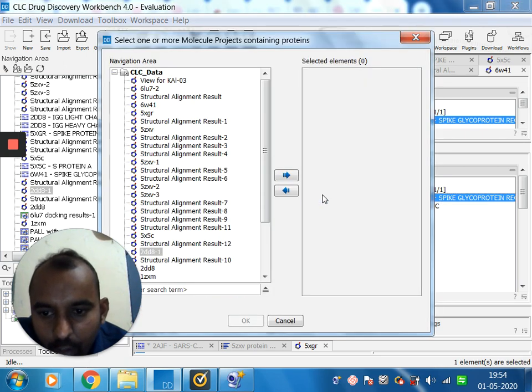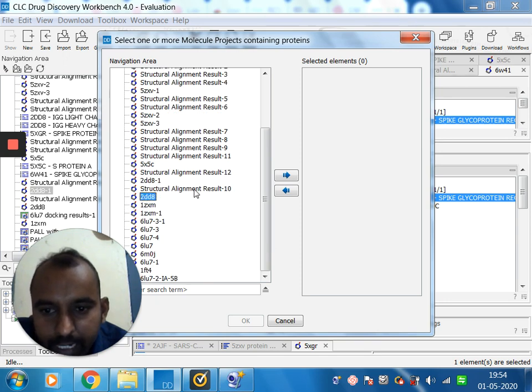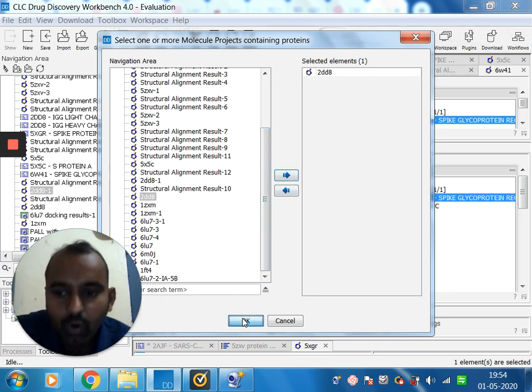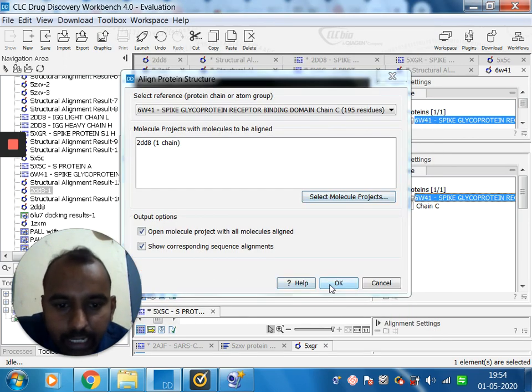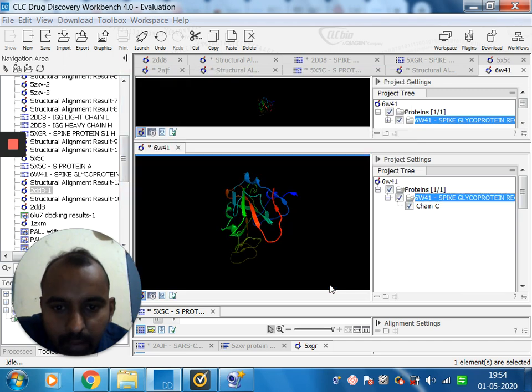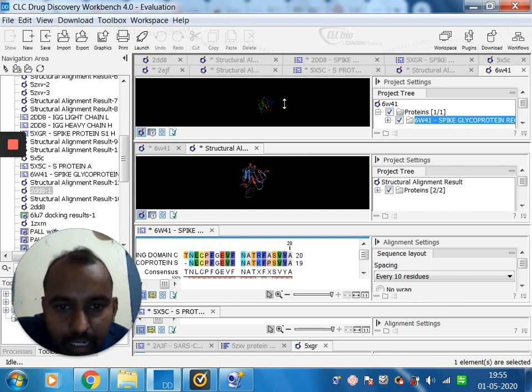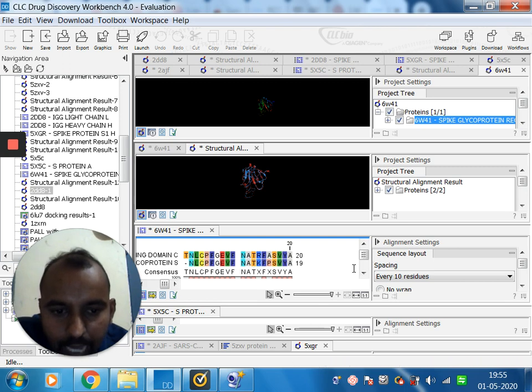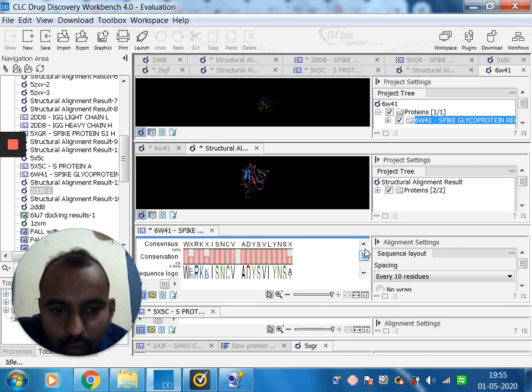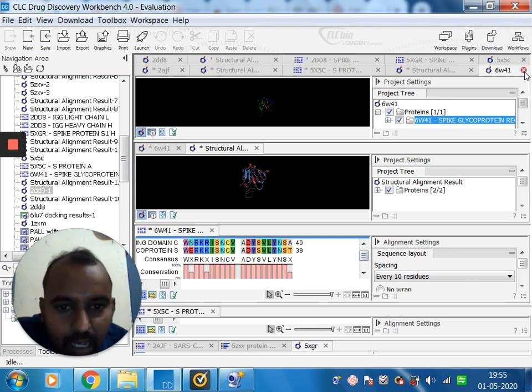Under align, I select molecular projects and choose protein 2DD8. I click OK and press OK again. The resulting data is very interesting — it shows the alignment of the sequence, demonstrating how sequence alignment works and how the data is aligned.